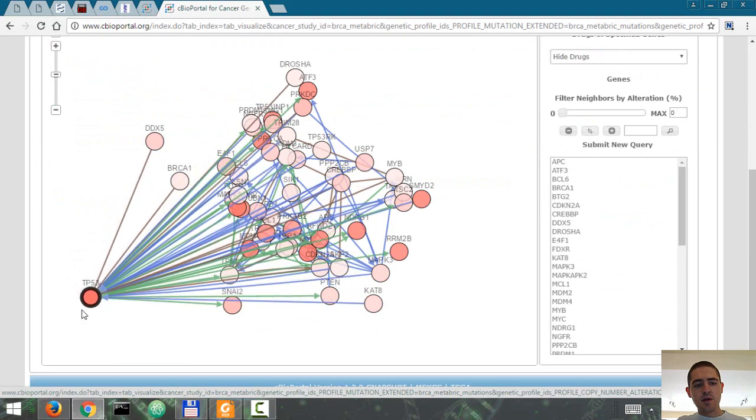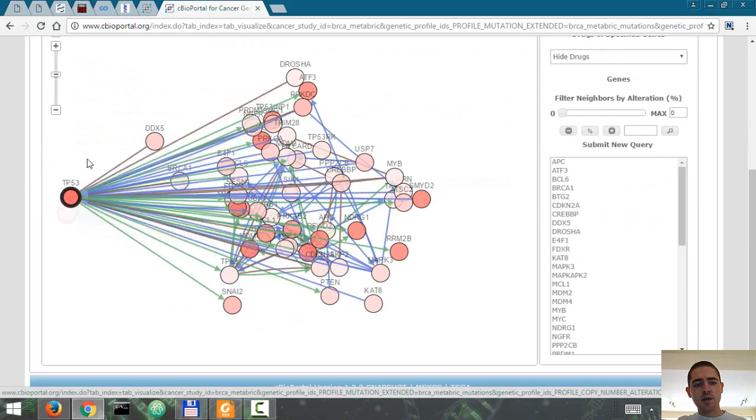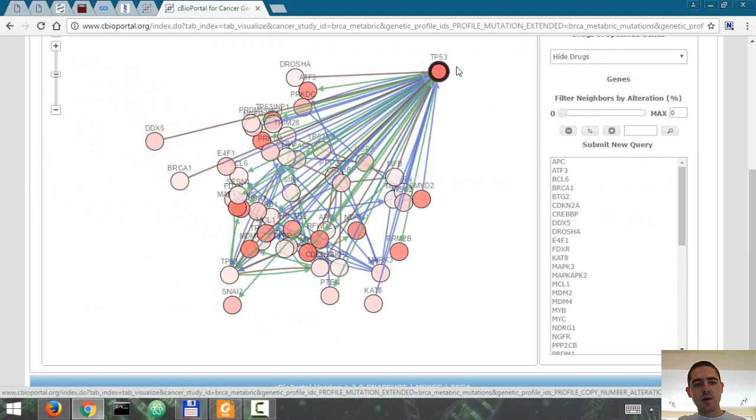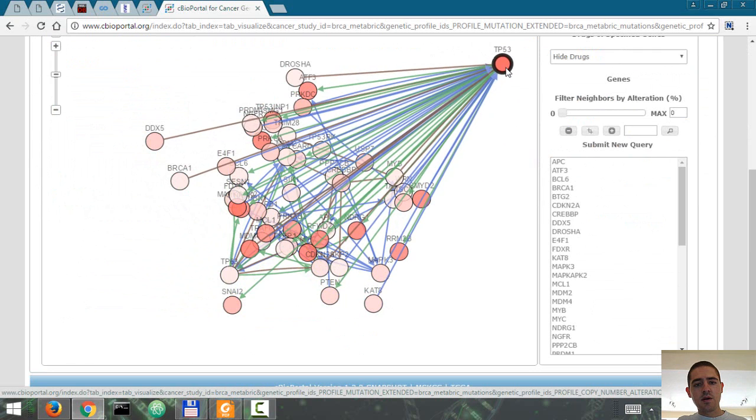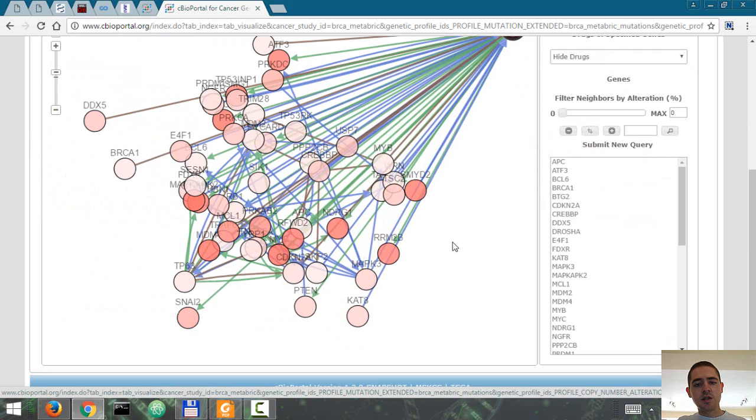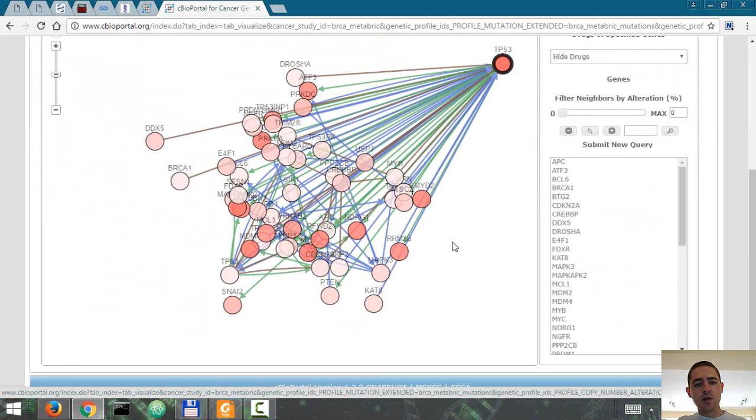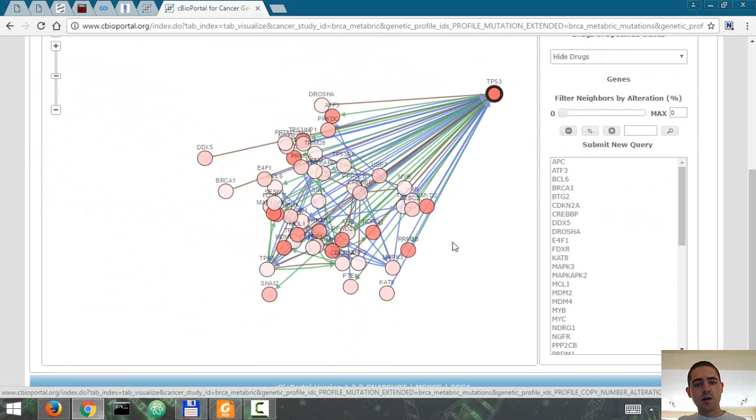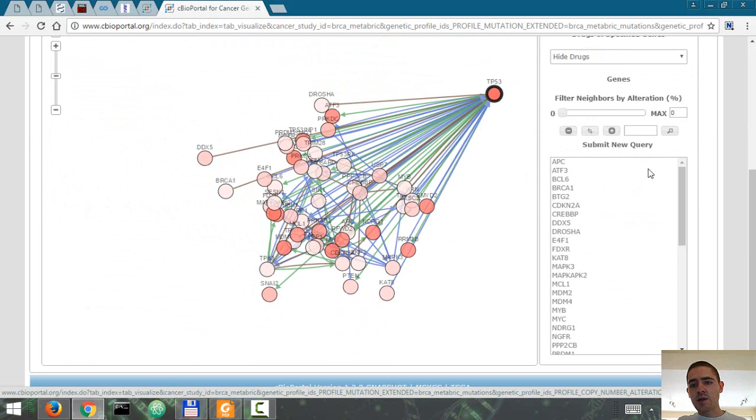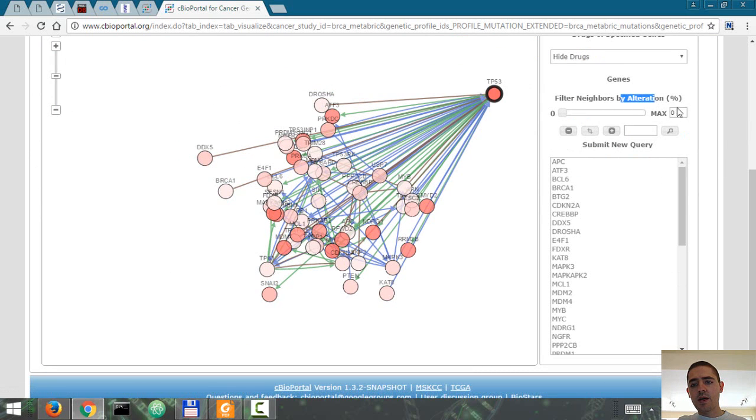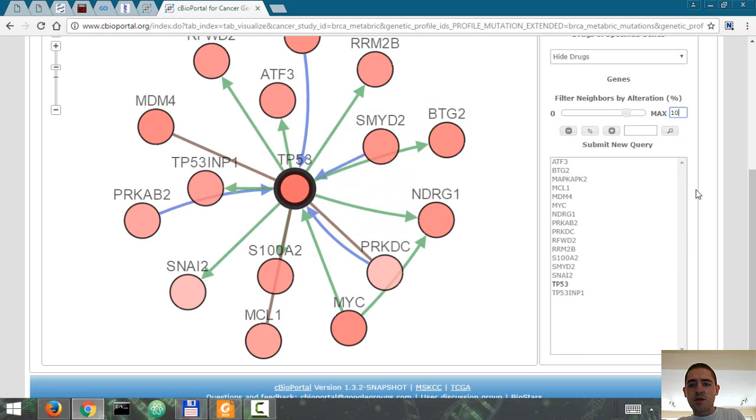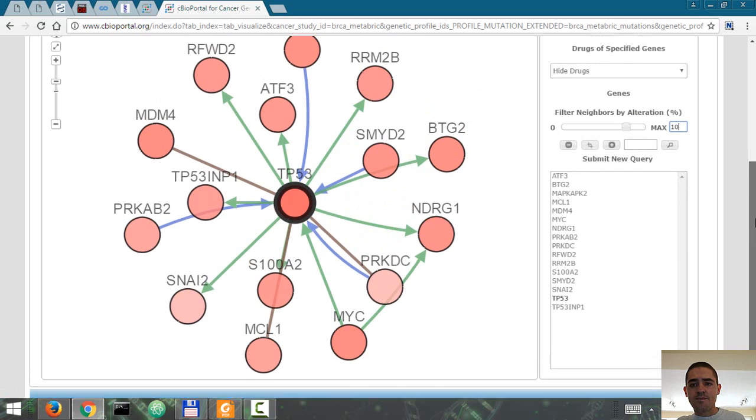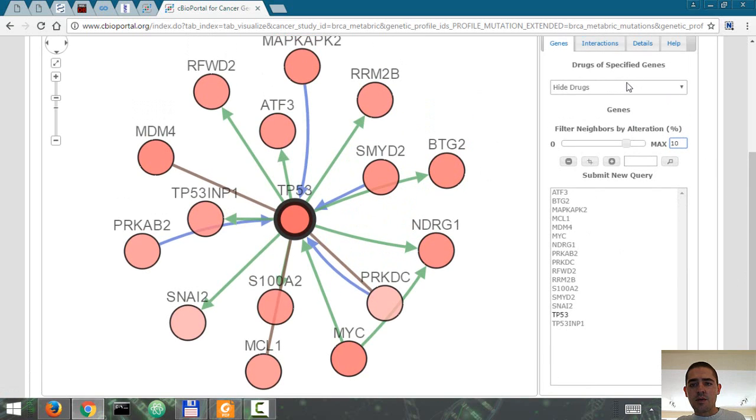And you can see the network of other genes that are related to it. Let's try and see other genes that are mutated in at least 10% of the samples. We're going to hide drugs.